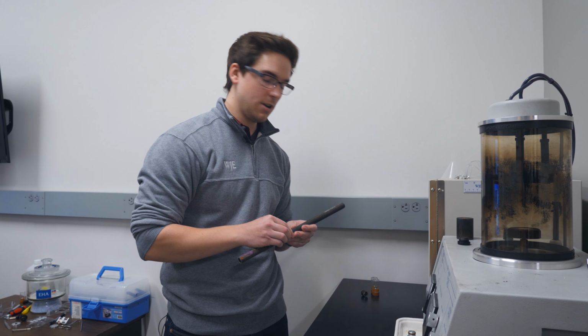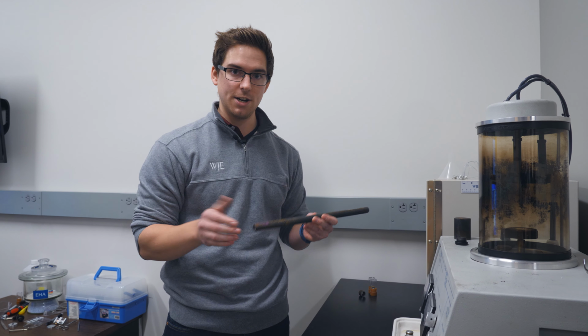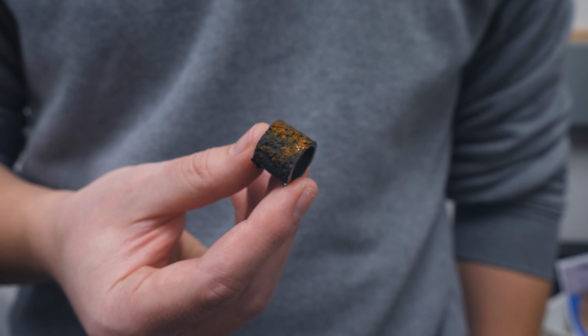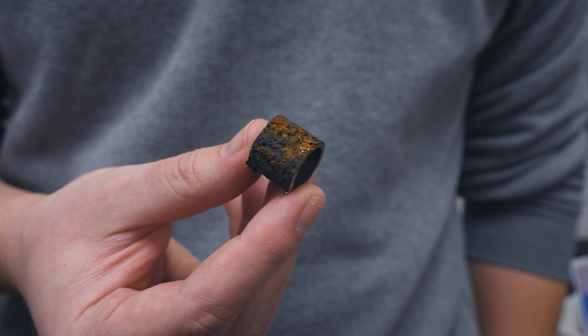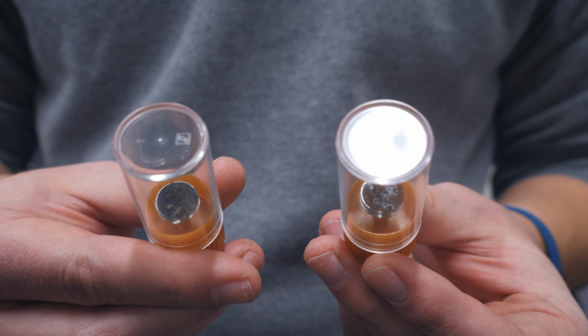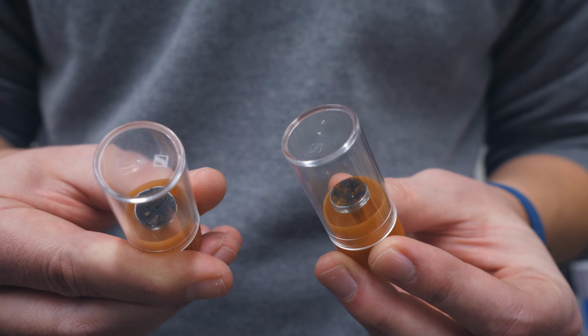In this case, the client wants to know what is causing the pitting and what they can do to prevent that in the future. So what we will normally do is take a sample like this and cut it on a saw and downsize it to something that looks like this, which we can then place in the SEM chamber, or we can scrape off some deposit and put it on an SEM stub with some carbon tape and put these in the SEM. In this case, we are looking for particular elements that are known to be corrosive towards certain metal alloys. Usually we're looking for elements like chlorine or sulfur.